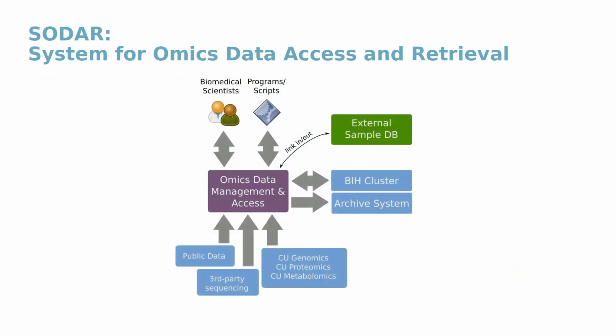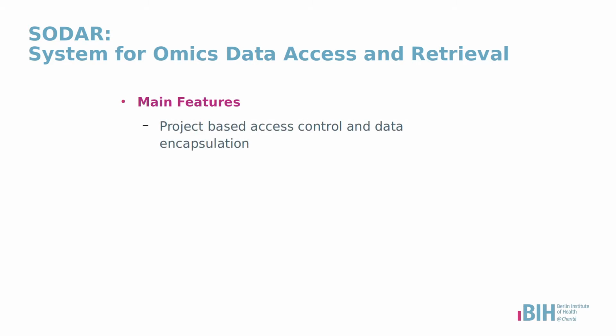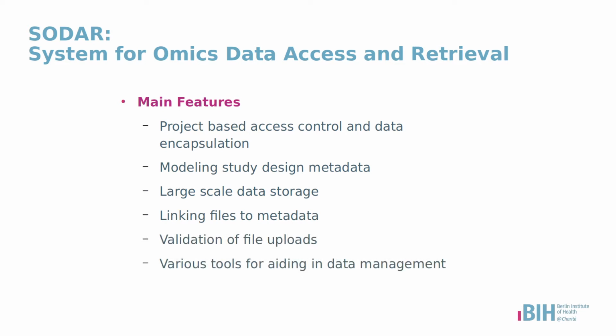SODAR provides biomedical scientists with a single point of access to data in their projects, along with linking out to external resources and systems. The main features of SODAR include project-based access control and data encapsulation, modeling study design metadata, large-scale data storage, linking files to metadata, validation of file uploads, and various tools for aiding in data management.